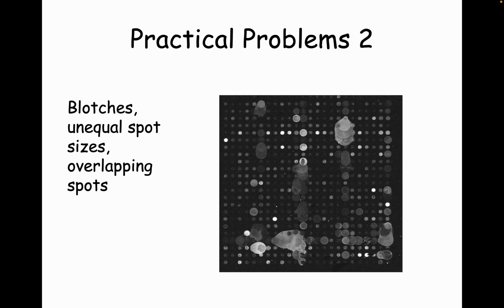And there are some things you can do to correct this. But one of those, and probably the best one, is you're usually not going to have just one spot on the array for each thing you're trying to measure. You're usually going to build in redundancy, which just means that you're going to have the same spots in multiple positions. So if something weird happens to the panel on the left, you've got an entire panel on the right, and you can read out multiple times for each experiment. And you can look at the variation.